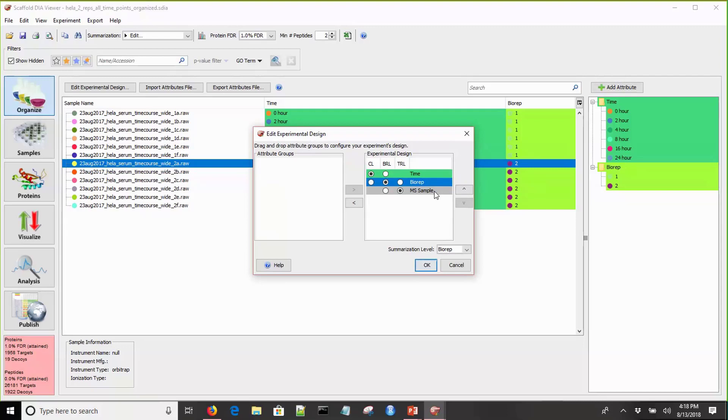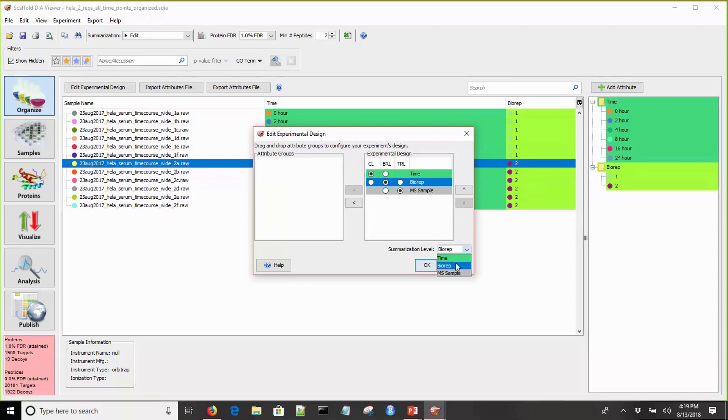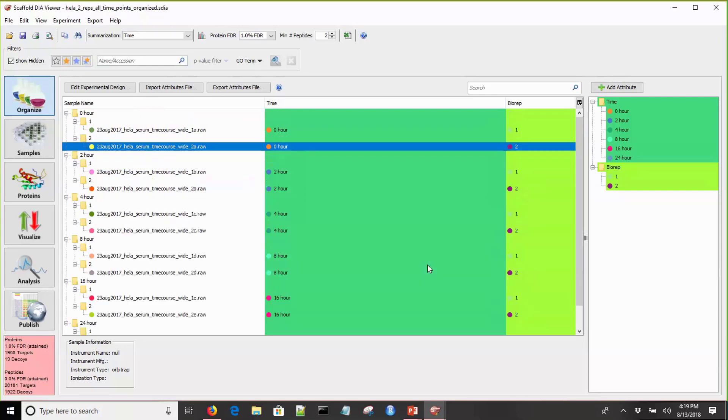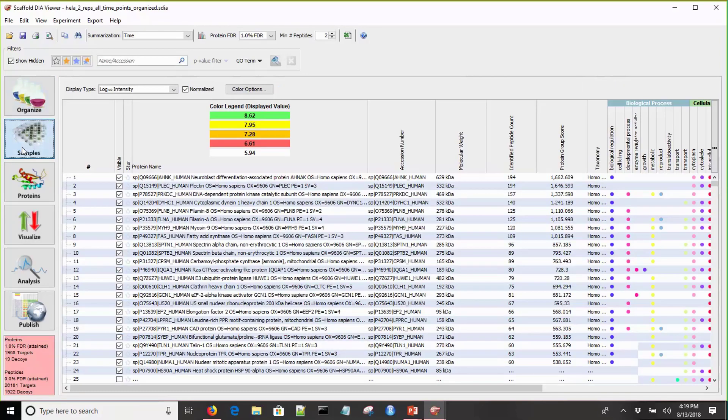Now we need to set the comparison level, the biological replicate level, and the technical replicate level. The comparison level is the summarization level that your statistical analysis is actually done on. Since this is a time course experiment, we want to set that to the time attribute group. We'll set the biological replicate level to the bio rep, and then the technical replicate level will stay on the MS sample level. Finally, down here we can set the summarization level to time. This sets the level that it's displayed at when we go back to the samples view. We'll click OK. Our samples are now organized.